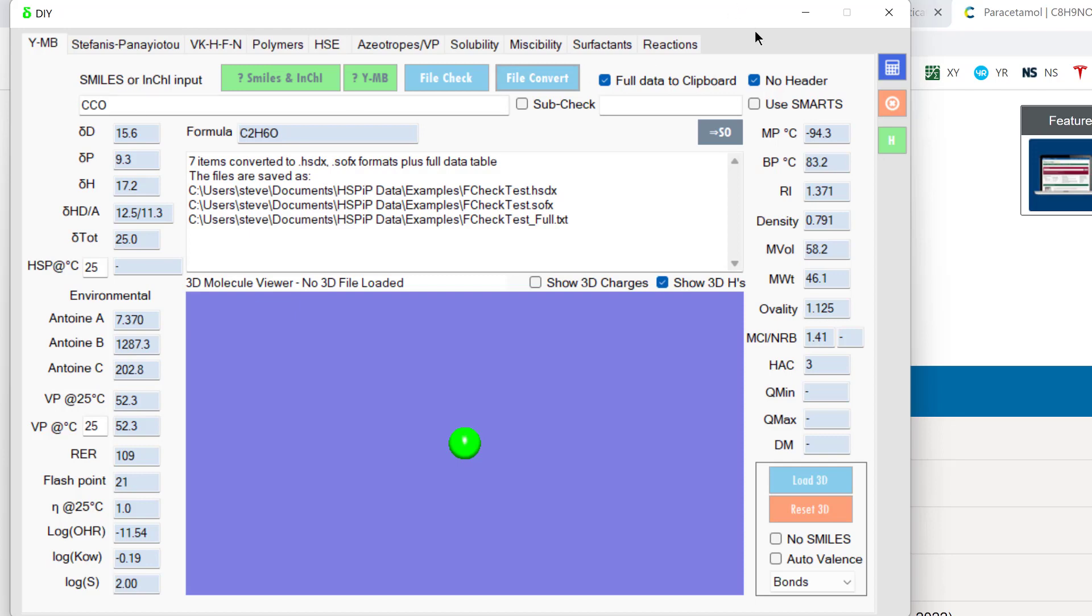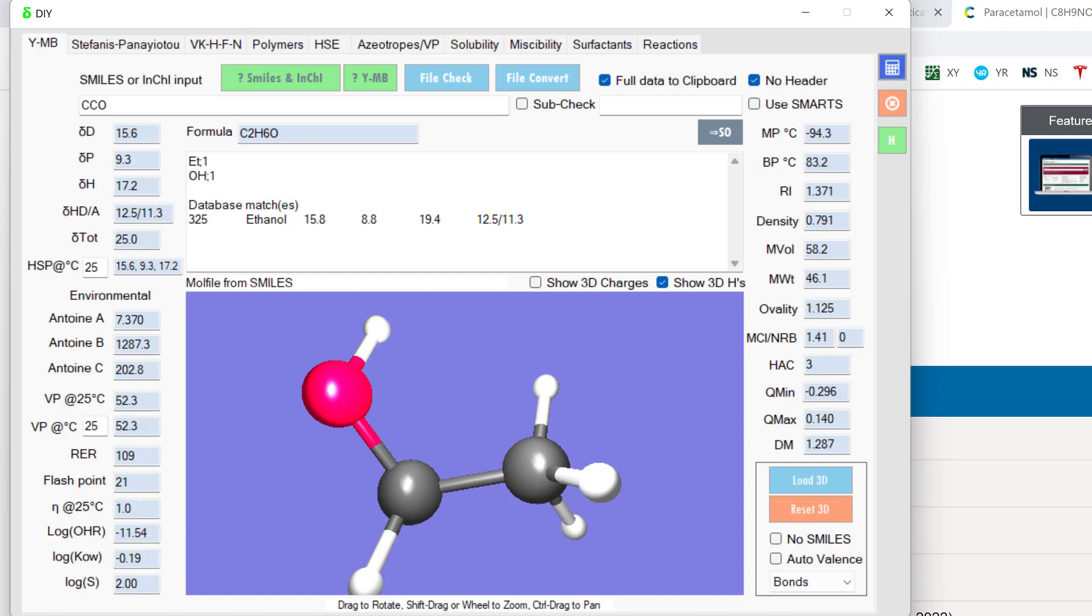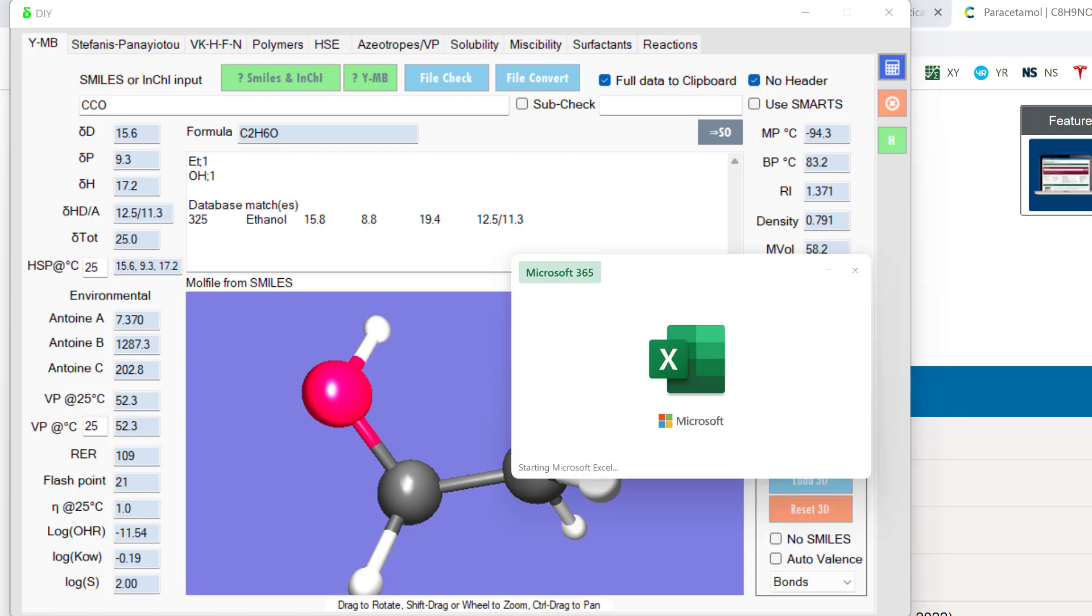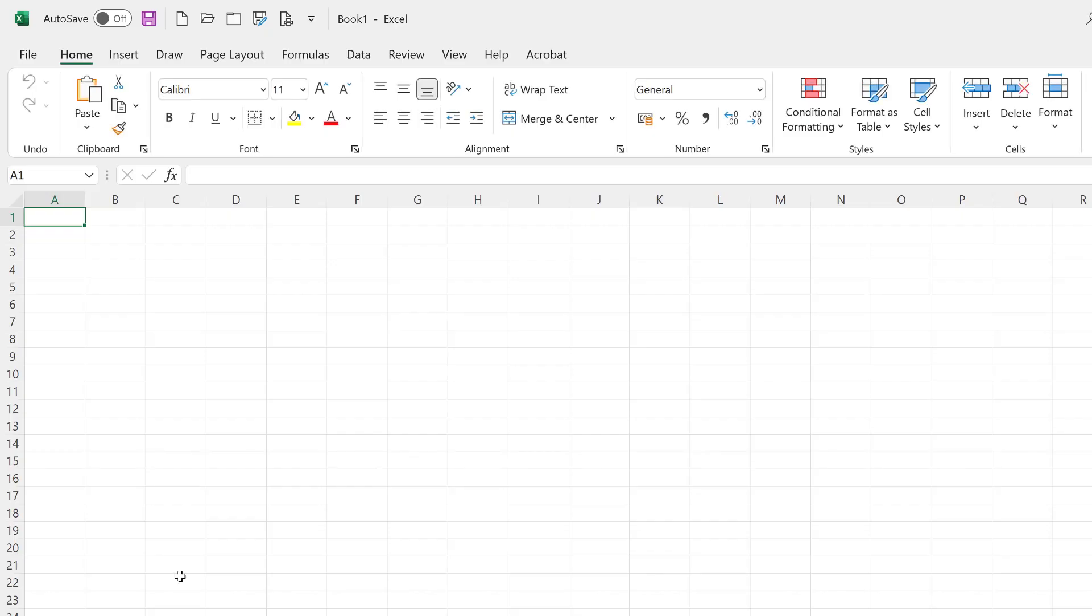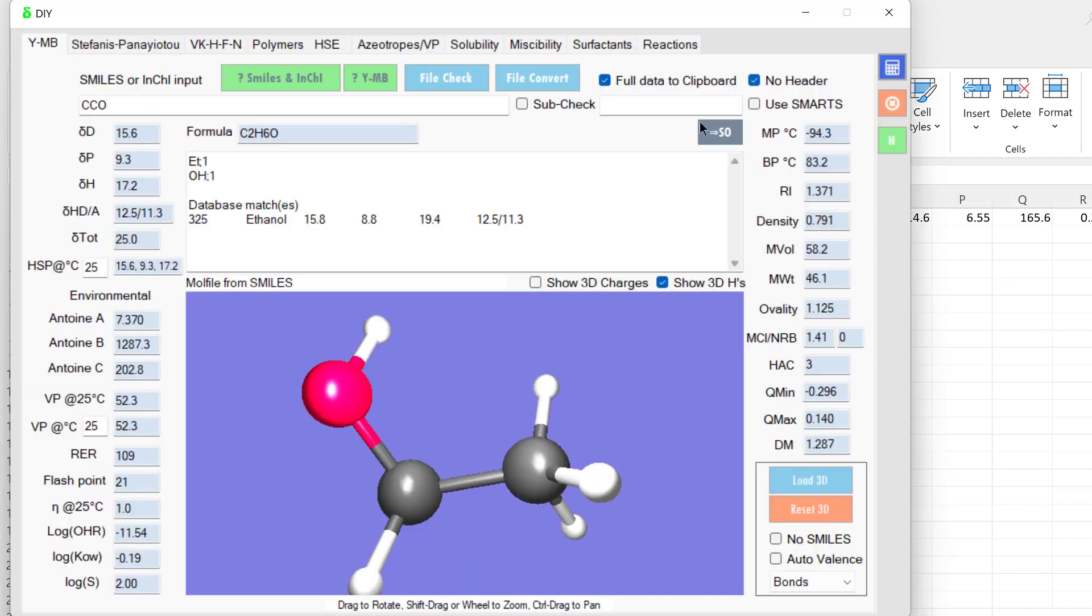Let's just do CCO again. There is the molecule. And as I said, we get a large number of estimates. These are put on the clipboard for your convenience. So if I load Excel and I do Ctrl V to paste, there are all the data. That's without a header.